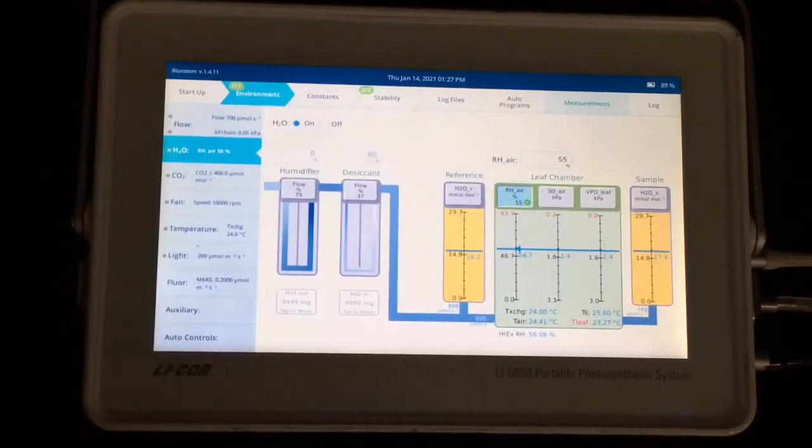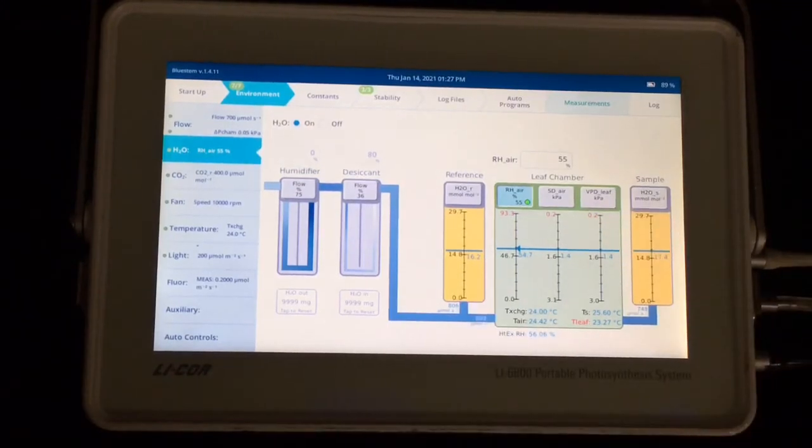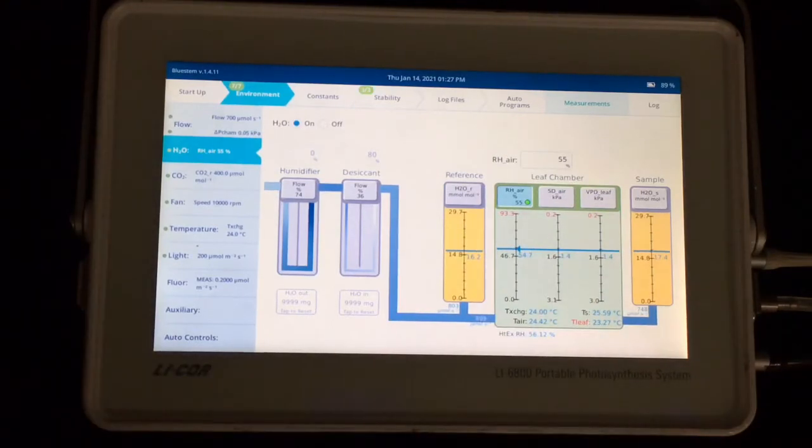Next is H2O. And here your choices are, as I've chosen, to set up the relative humidity in the sample cuvette. You could also set the mole fraction on your reference or the mole fraction in your chamber alternatively, or you can set on the VPD. From my experience, a good compromise with this instrument is to choose to control on the relative humidity. So that will be constant throughout your measurements. Again, it is a slightly longer time for the control loop to reach stability than if you were controlling on the reference. Because every time you close that chamber and the conditions have changed, the control loop has to re-engage to hit that setpoint. But it will provide less noise in your data because you're guaranteeing that relative humidity is constant for all of your measurements.